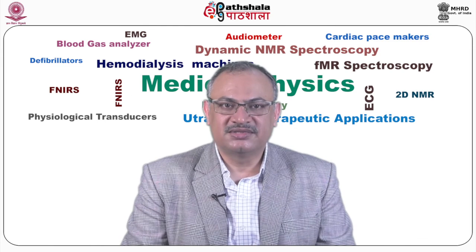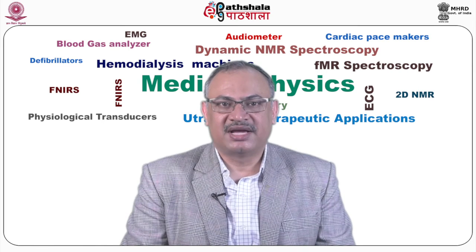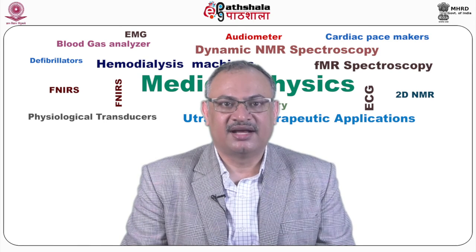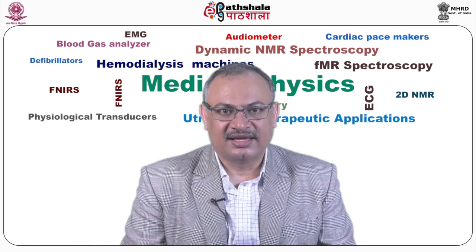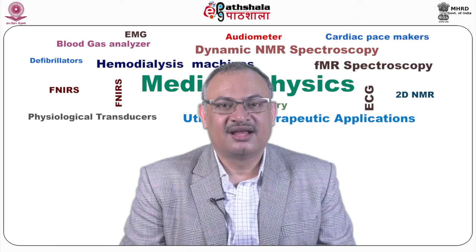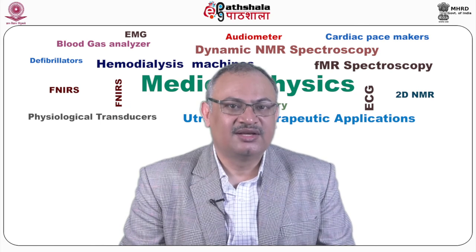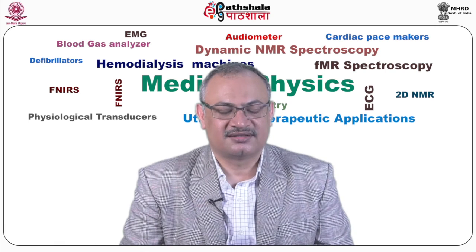The side chain carbons are frequency labeled. From here, magnetization is transferred to the carbonyl carbon, onto the amide nitrogen, and finally the amide hydrogen for detection. This spectrum correlates the HN-N of the amide group with the carbon side chain of i-1, from the side chain of the preceding residue. It is especially useful for assigning the side chain carbons of proline residues.